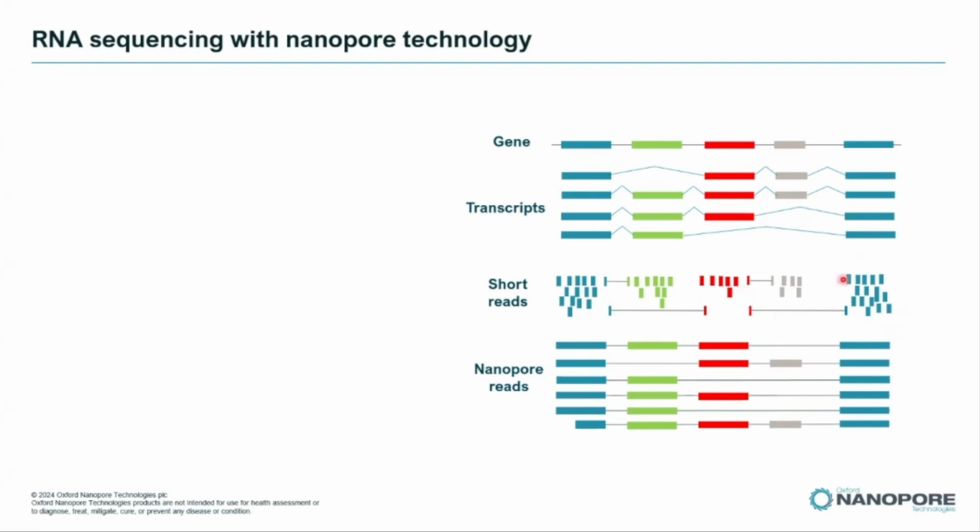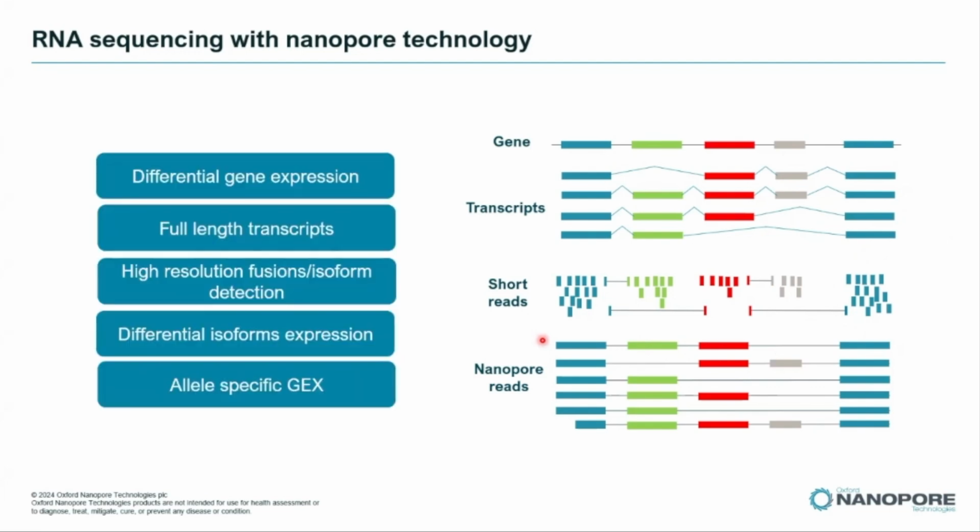If we look at the extremities, those blue reads, we don't know which transcript they belong to. They might belong to one or the other, so we can't quantify the isoforms. Similarly, we see here a breakpoint for one isoform, but if we were not sure that we have 4 isoforms, we wouldn't be able to determine if this one belongs to the 3rd isoform or to a 5th one that has been unraveled. With long-read nanopore sequencing, every read will span the entirety of the isoforms, and we can therefore detect them without any doubt, detect novel isoforms, and also precisely quantify the isoforms.